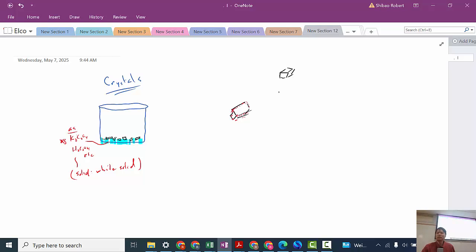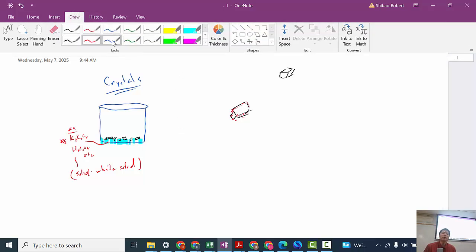Our process is called characterization. You know, we want to be able to characterize the crystals. So we don't want to lose that information if possible. But then again, we don't want to contaminate this. And so what we'd like to do today is we'd like to pour off any of the liquid that's in here if you have crystals. And then we want to wash these with ethanol. So normally what we'll do is filter, but hopefully you have big enough crystals that you can just decant.